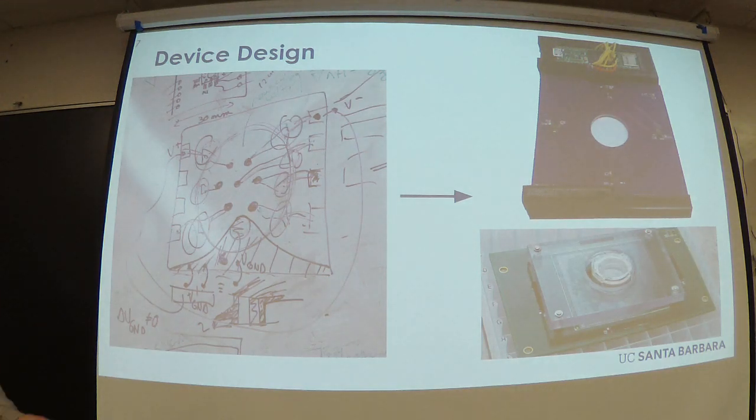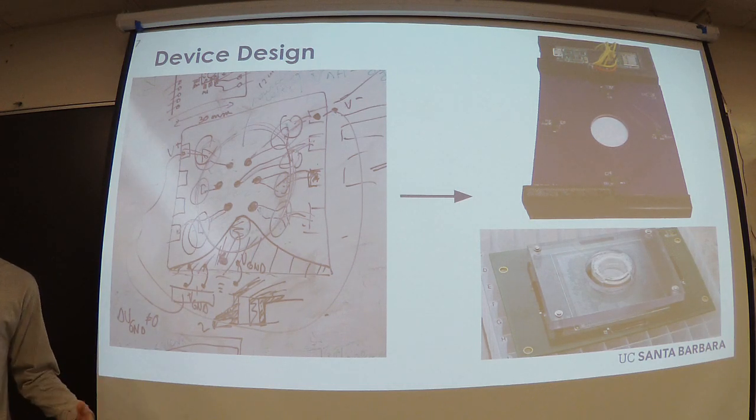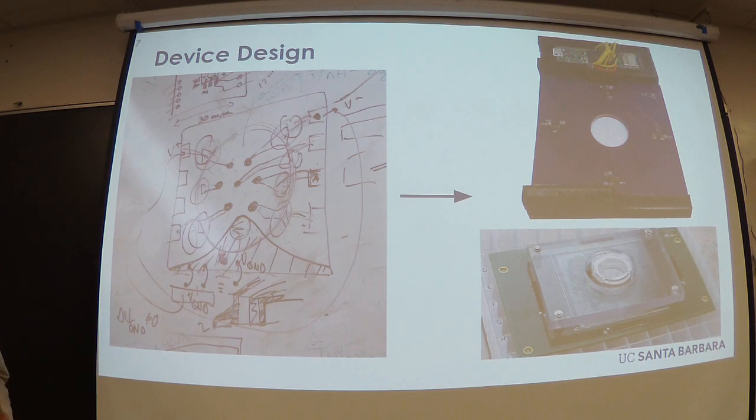So, how do we go from just looking at the whiteboard and saying, hey, I'd like to build a transparent microelectrode array, to actually having one and having these sorts of finished prototypes? What we ended up doing was breaking this into two pieces. The first piece was building the electrodes themselves, getting this transparent substrate with electrodes on it. And then after that, we'll worry about all of the complicated electrical engineering that you need to do to send signals in, read signals out, and all of that mess that isn't this little glass bit in the middle.